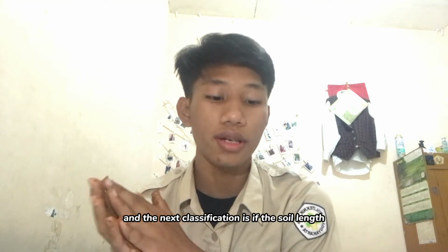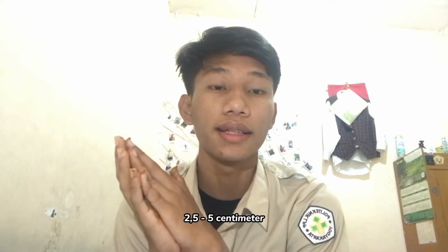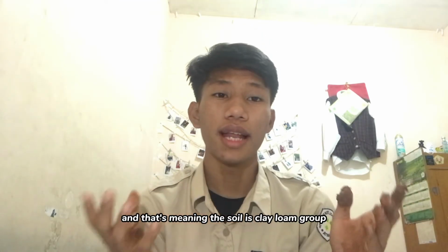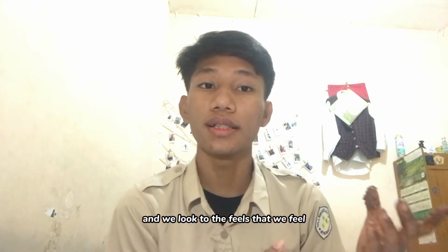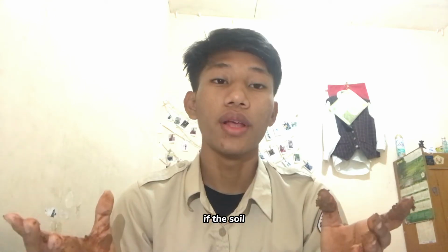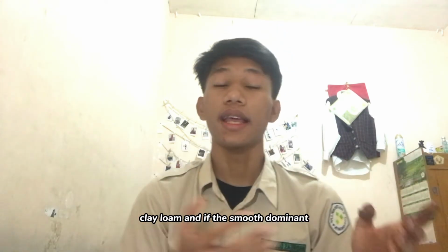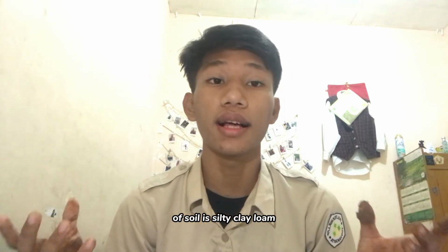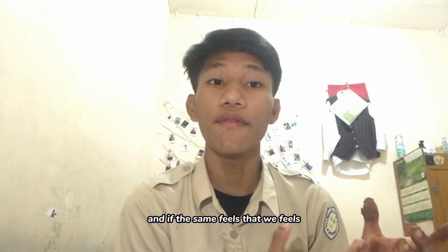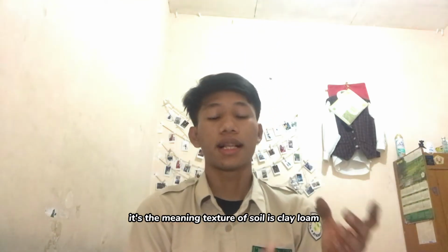And the next classification is if the soil length is 2.5 to 5 centimeters, that means the soil is in the clay loam group. And we look at the feel that we felt. If the soil is rough dominant, that means the texture of soil is sandy clay loam. And if smooth dominant, that means the texture of soil is silty clay loam. And if the feel is the same, it means the texture of soil is clay loam.